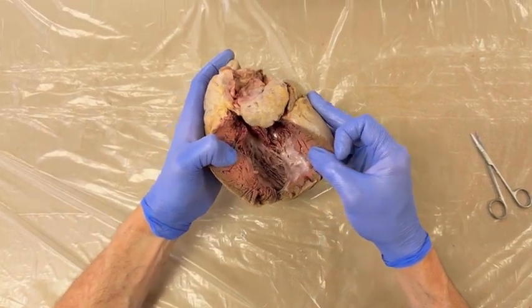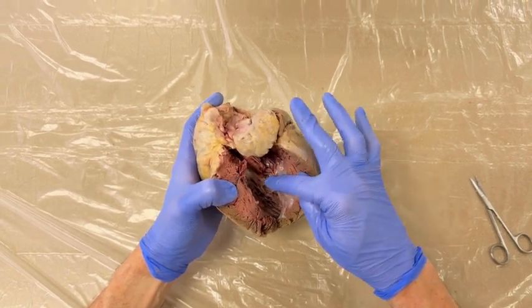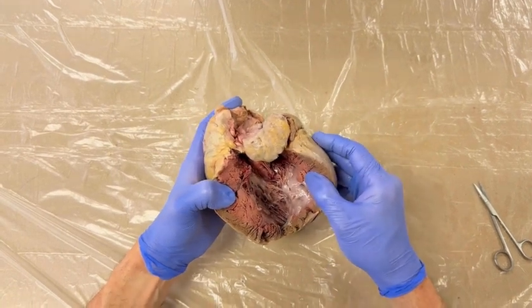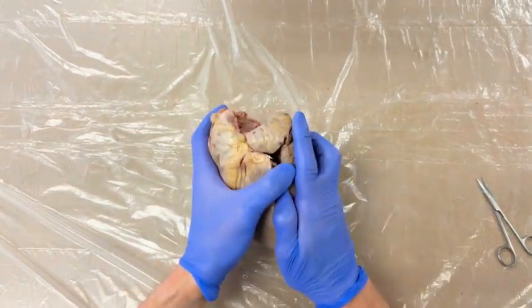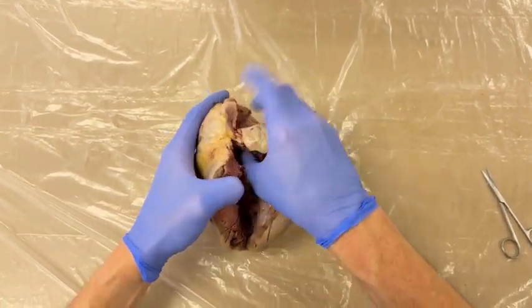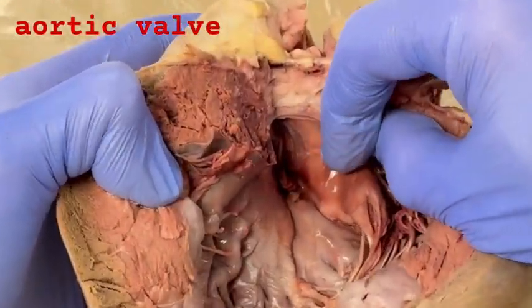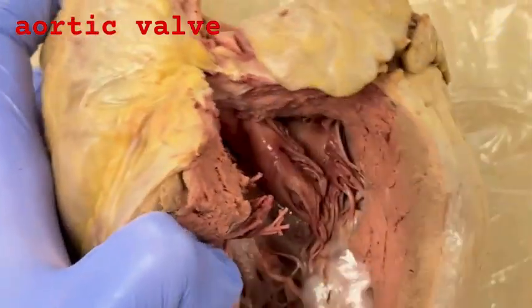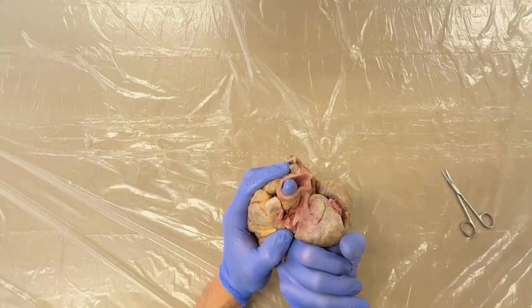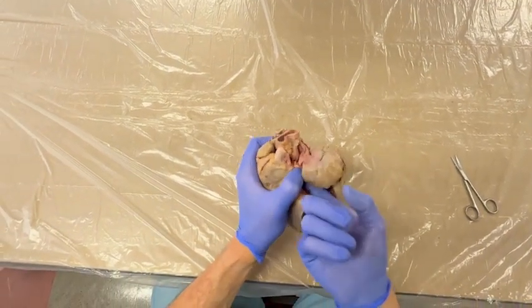So we've opened up the left ventricle fully, and you can see the connections, the chordae tendineae of the mitral valve to the left ventricle. The last structure on the left side is the aortic valve. So when the heart pumps, blood flows out of the heart to the body from the left side. And you can see that right here, where my finger is the aortic valve. So blood flows from the left ventricle out the aortic valve through the aorta, which is the large tube that carries blood to the body.